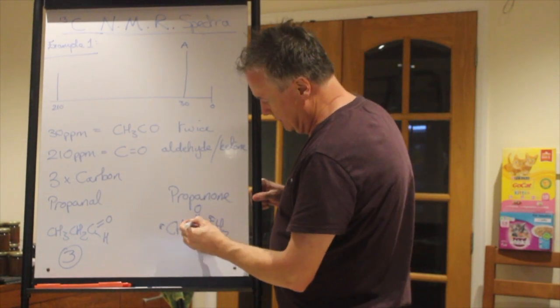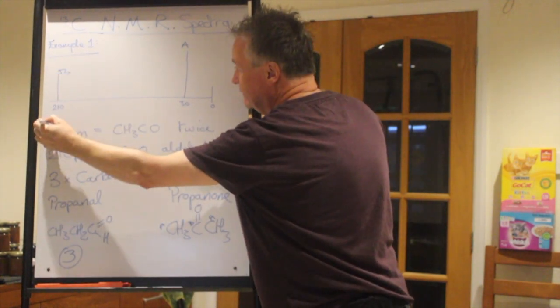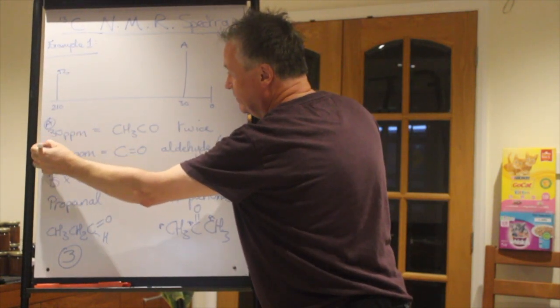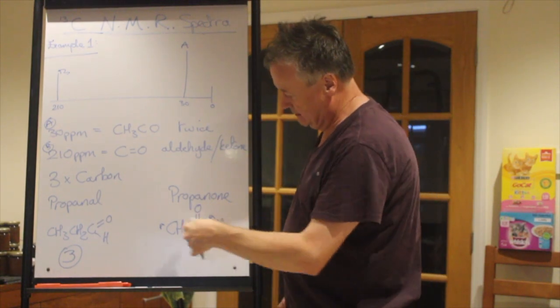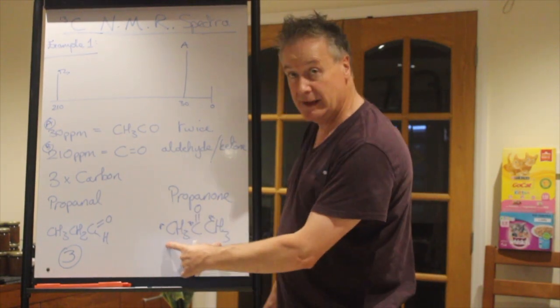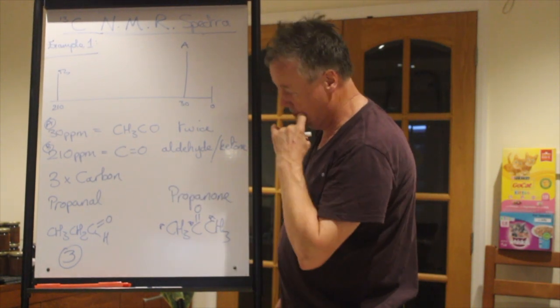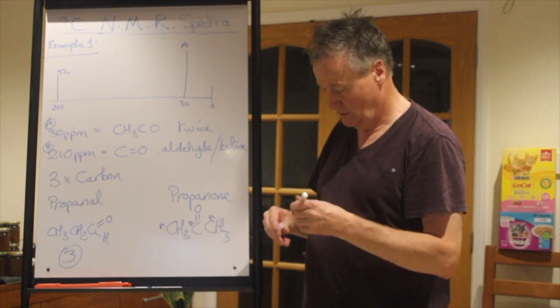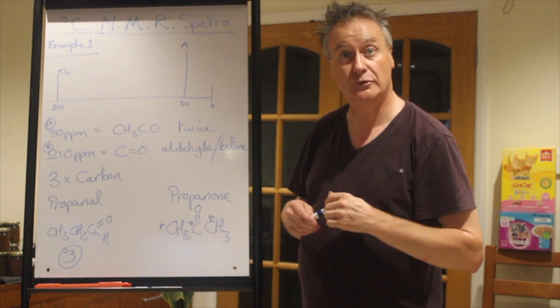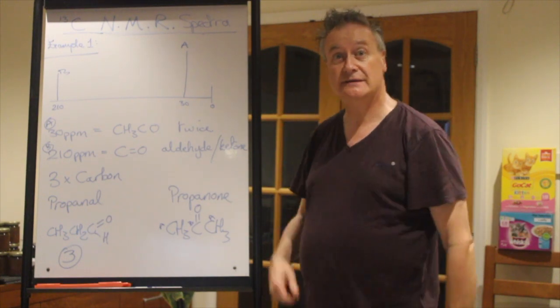And then this one is B, which is this one. So that is A, that is B, so all the letters match up. And that makes sense, because 2 A's, twice the height, a B, much further to the left, it's propanone. There we are. We'll do another one, but I'll need to get the board drawn, ready to do it. So I'll see you after the edit.